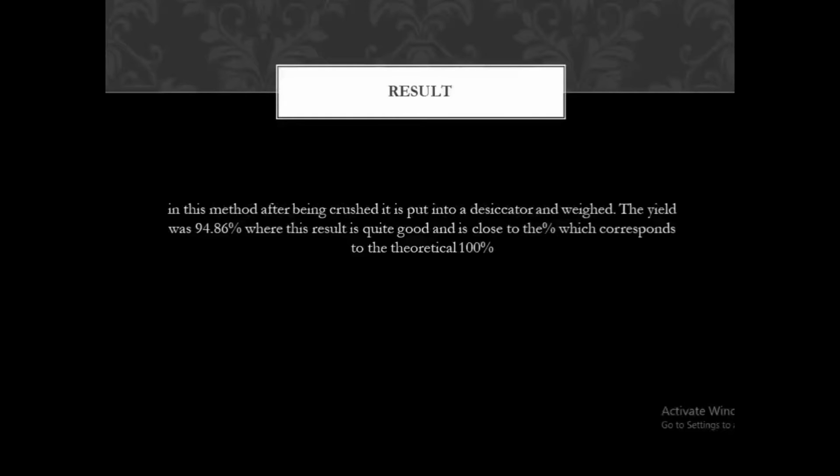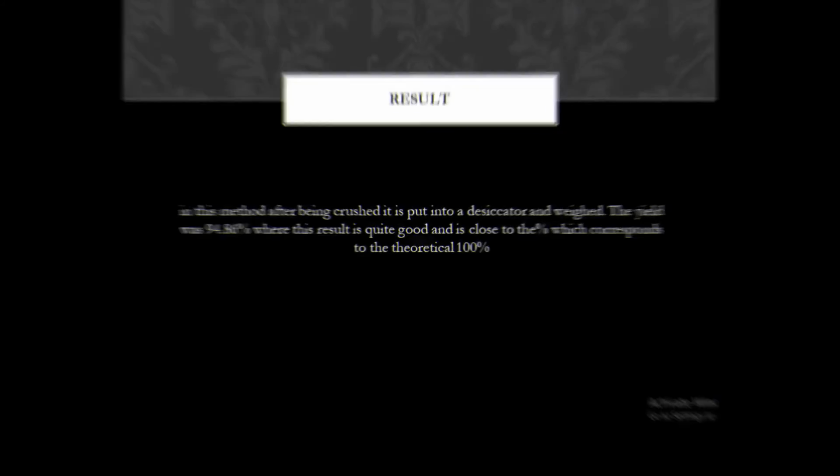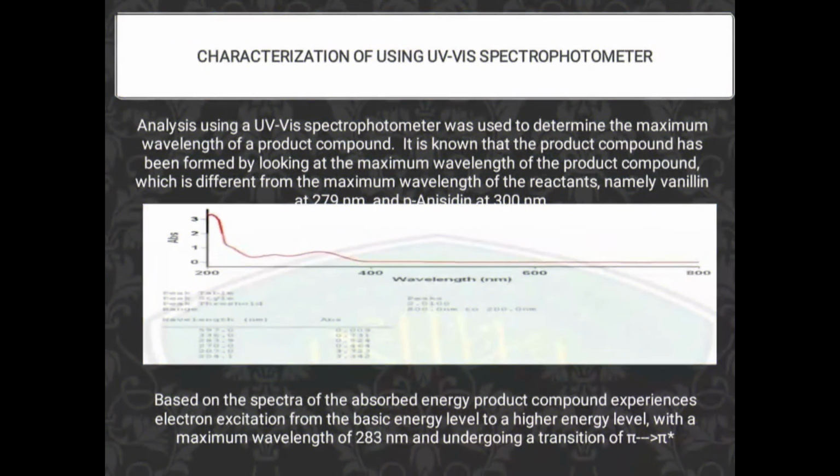After being processed, the product is put in a desiccator and weighed. The yield was 94.86%, which is quite good and close to the theoretical 100%. Characterization using a UV spectrophotometer.